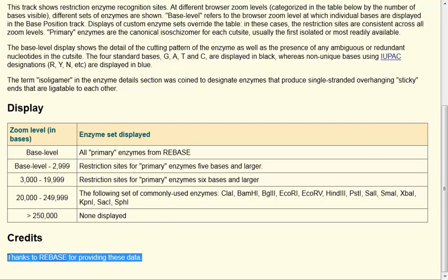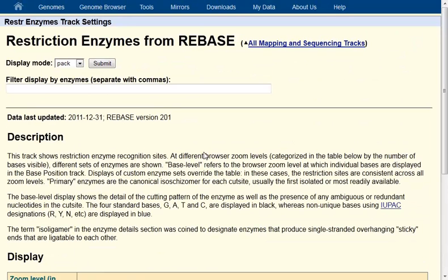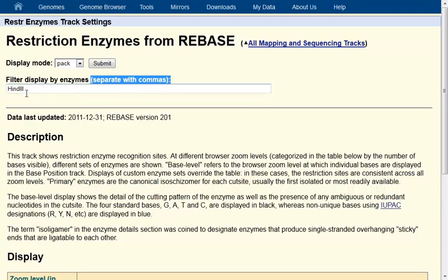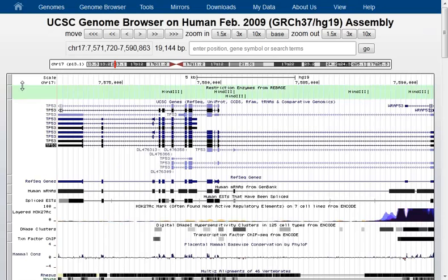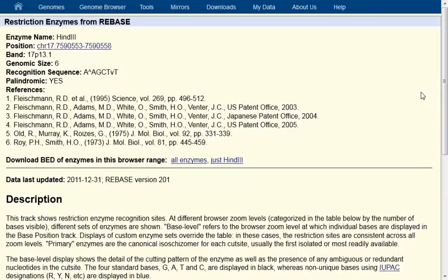One of the things we might want to do is filter. Let's say I just wanted to look at where the HindIII cutting sites might be. I'm going to enter the enzyme I'm interested in — you could enter more than one if you separate them with commas. All I want to do is look at those instead of the huge list we had before, so I'll click Submit. Back on the browser in the restriction enzymes area, you'll see that just the HindIII sites are on display. That might give me all the information I need about this region. I could also click on any of the HindIII entries to get more details about its specific position.